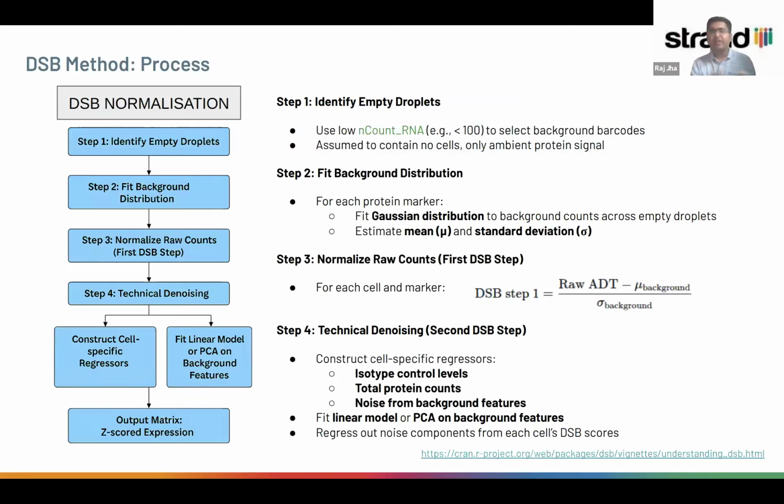So whenever we are doing single cell RNA sequencing or anything related to single cell RNA sequencing data analysis, we use cell matrix generation platforms, for example Cell Ranger. Now, whenever we are using Cell Ranger, it is always advised that you should use the filtered matrix. However, in this case, we'll not be using the filtered matrix, we'll be using the raw matrix. Now, what is the difference between the filtered and raw matrix?